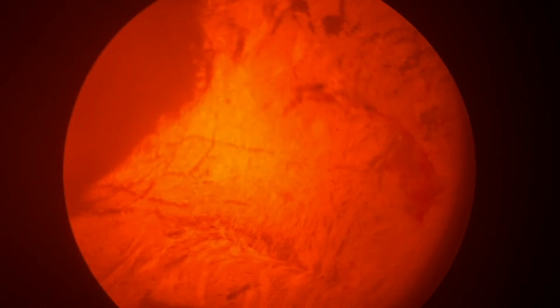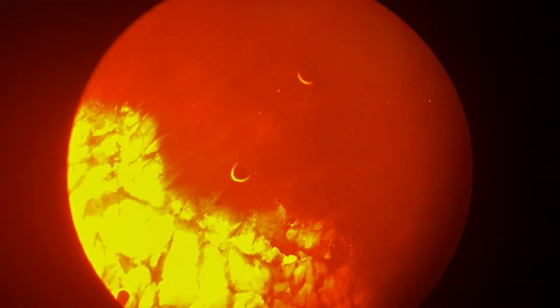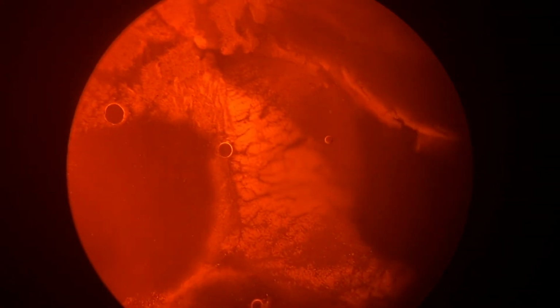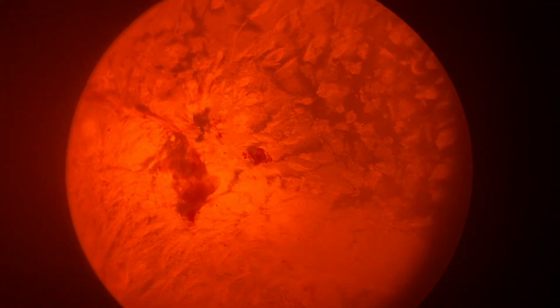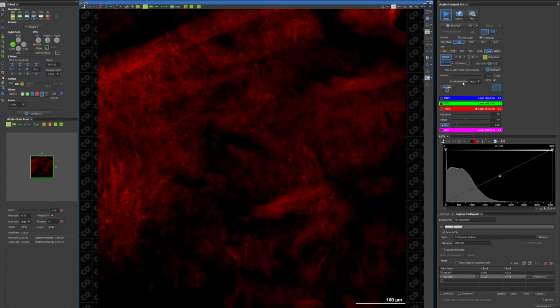Now, this is strange. It's bright, like way too bright, which I think might be due to the fact that I used the same protocol of a 4-year-old stain on a brand new stain. But it's also strange because these aren't neurons. It's more like clumps, and while I'm glad something happened, I'm going to need to take a closer look to see what's actually going on.